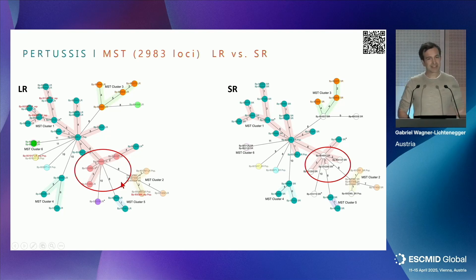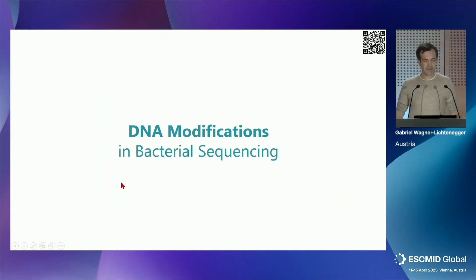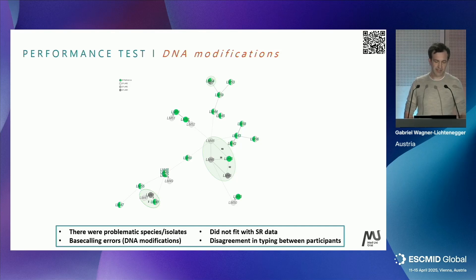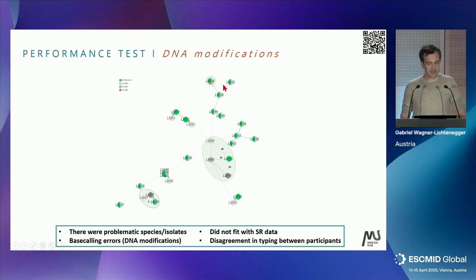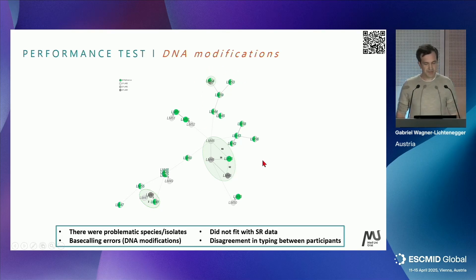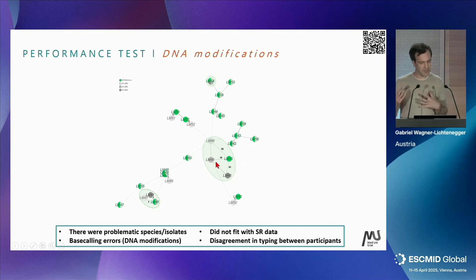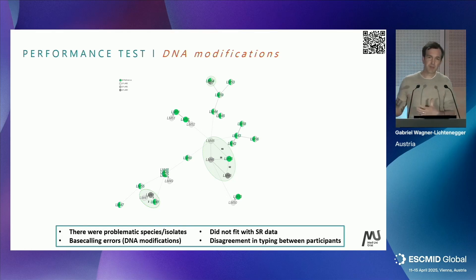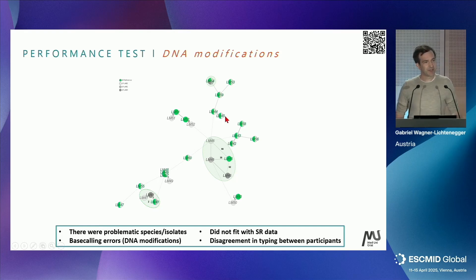That was pretty good and we were really excited. But then reports came up that this is not always the case — this is related to DNA modifications. We also ran a multicenter study analyzing different species. For Listeria, the short read data in the tree is in green and the long reads are in gray. Most of the time this works pretty well, but there are certain isolates where the long read data doesn't match the short reads or even each other. We traced that back to DNA modifications, which also explains why some people, even within the same species, were reporting very good results while others said this is not working.